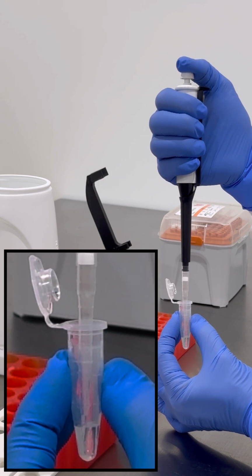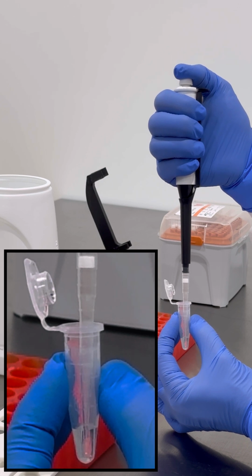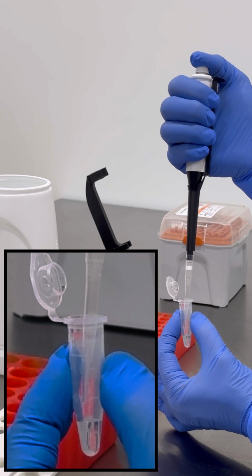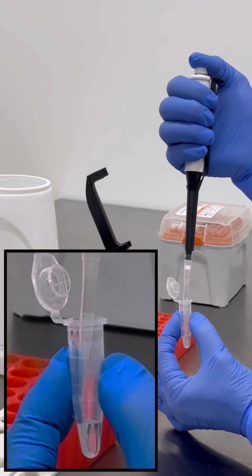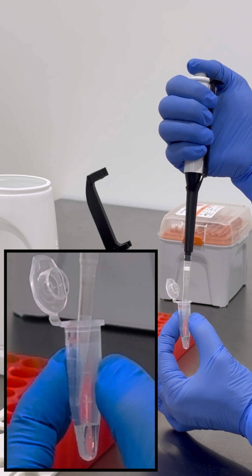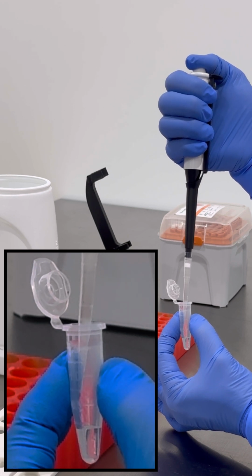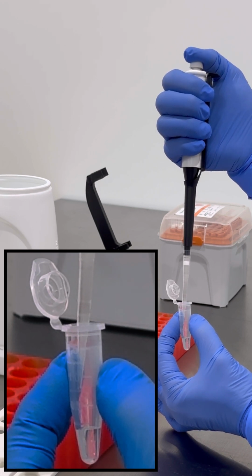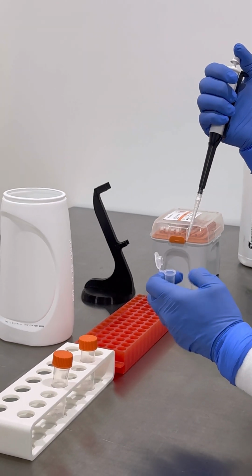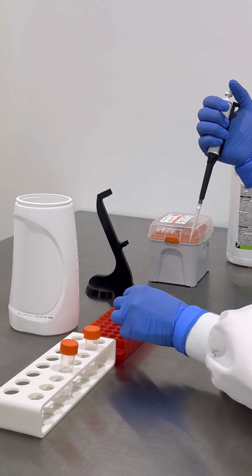At the last downward button press to the first stop, hold, and then lift the tip just clear of the liquid. Touch the tip to the inner wall of the tube just above the liquid and press the button further through to the second stop and hold to eject all the remaining liquid onto the tube wall. Move the tip off the wall of the tube whilst holding the button at the second stop. Slowly release the white button and lift the tip clear of the tube. Close the tube lid without touching any internal parts and place the tube back into the reagent rack.